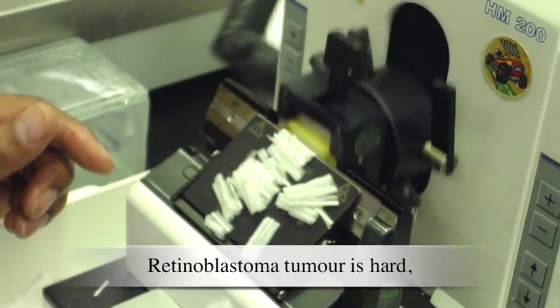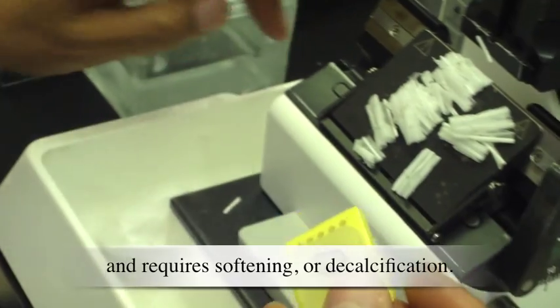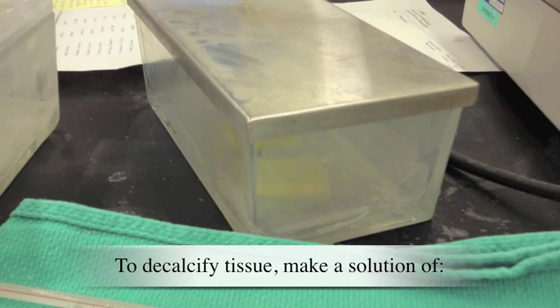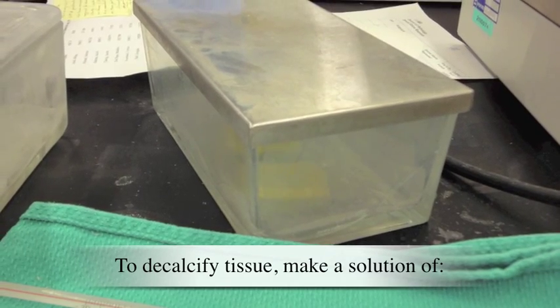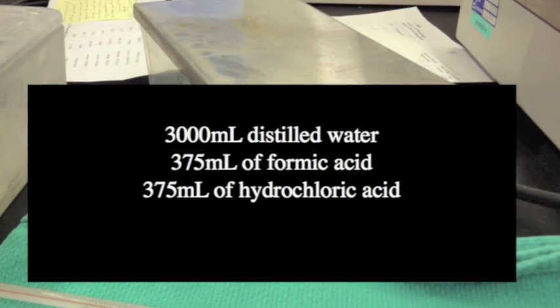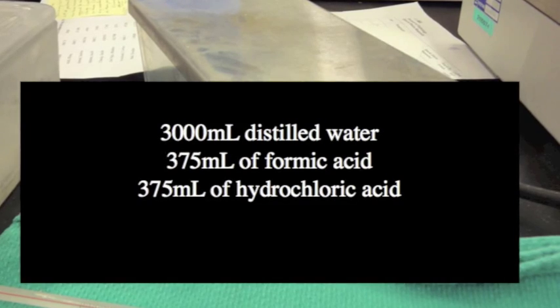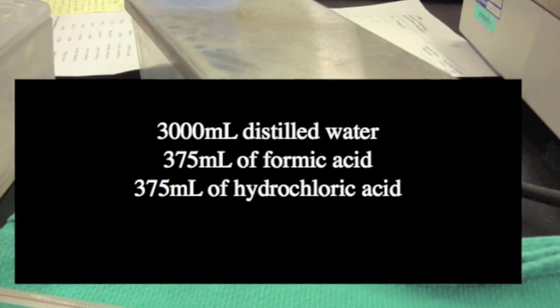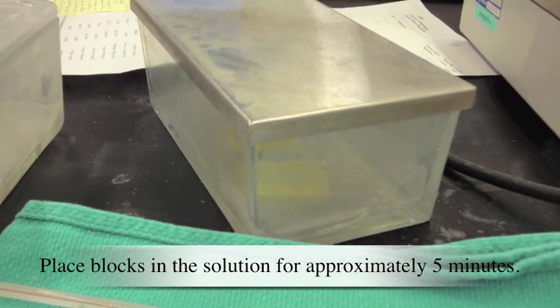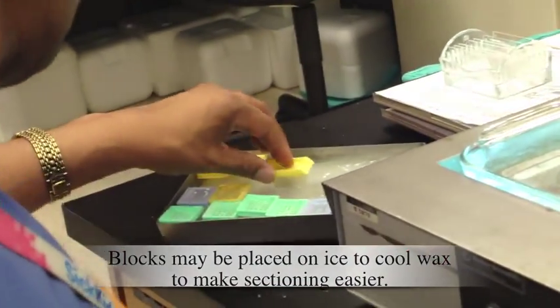Retinoblastoma tumor is hard and requires softening or decalcification. To decalcify tissue, make a solution of 3,000 mL distilled water, 375 mL of formic acid, and 375 mL of hydrochloric acid. Place blocks in the solution for approximately 5 minutes. Blocks may be placed on ice to cool the wax to make sectioning easier.